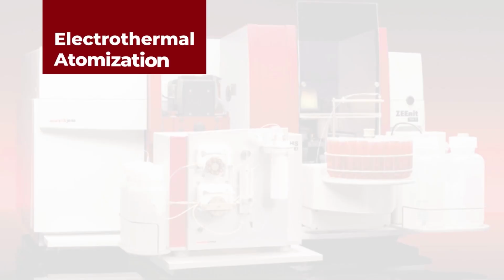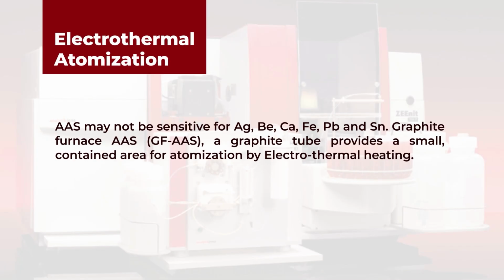So, for that, what is generally done is that a graphite furnace is used. It's basically a graphite tube which provides a small contained area for atomization. And atomization is done by electrothermal heating. It's not done by gas heating, okay. It's not the air, it is not different gases burning, it is electrothermal heating.